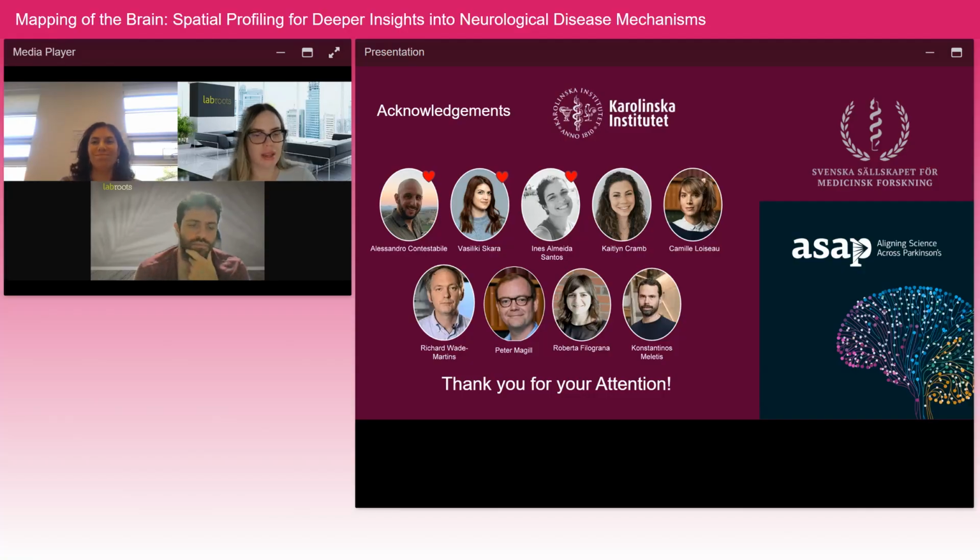Okay, great. Manisha, this next one is for you. It says, how do researchers decide between using a custom panel and a pre-designed MERSCOPE panel for neuroscience studies?